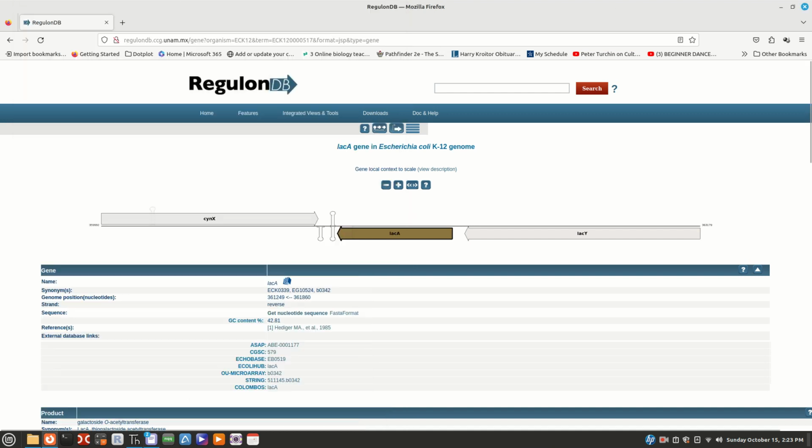All right, and then we want the gene after this because, look, now they're giving you some hints here. Look at this. What do you think this is? Those are terminators, and they're actually even telling you the type. We've generally talked about the generic type, but now you know from looking at this what type the lac operon uses. You can use that in your paper to find yours. If you don't find a paper on it, you can find it from here, hopefully.